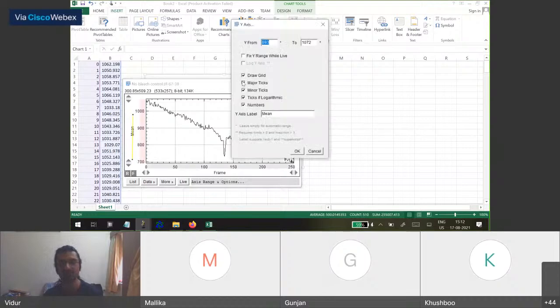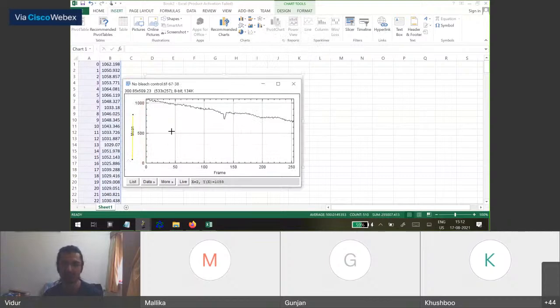In that scenario, it's a good idea to just go here, press 0, and the 50% mark will always be marked by a line. So you can quickly see whether it's less than 50% or more than 50%. Yeah. So that's why it's a good idea to always do this at the microscope itself.